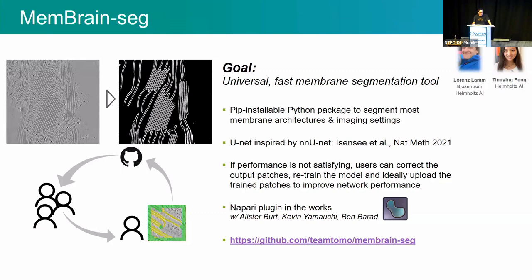And we are also working on a napari plugin for MemBrain-seg with help from Alister, Kevin, and Ben Barad from the group of Danielle Grotjahn at Scripps. And yes, everyone is welcome to take a look and give it a try already. We are happy to help you using this tool. Whether you want to share some data with us to train the model on your data, or if you want to try it by yourself, we would be happy to hear your experience with it.